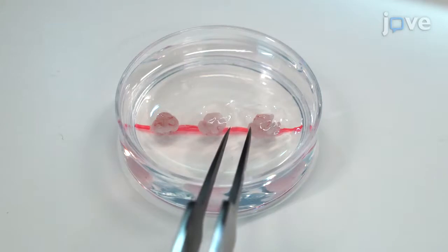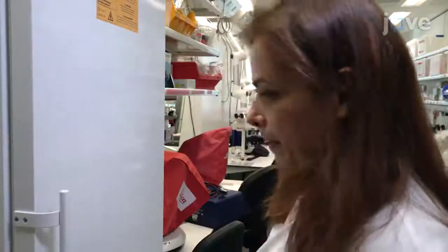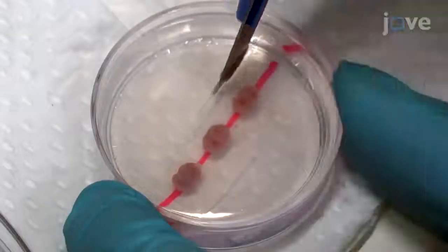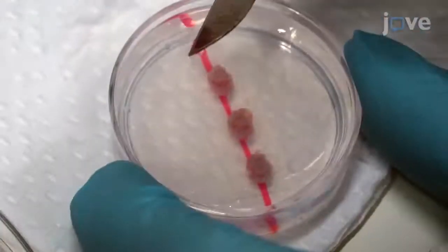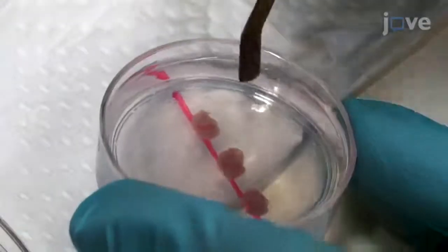When all of the brains have been embedded, place the dishes at 4 degrees Celsius to allow the agarose to solidify, and carve the 3 brains into a single block of agarose, leaving approximately 3 millimeters of gel around the edges of the samples.